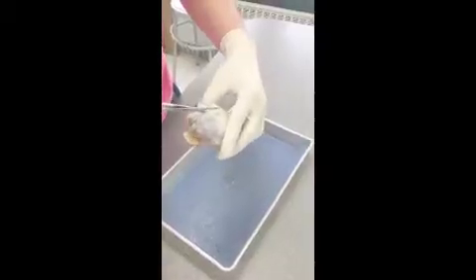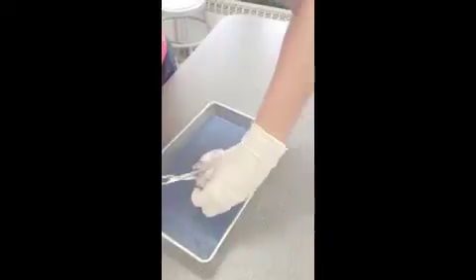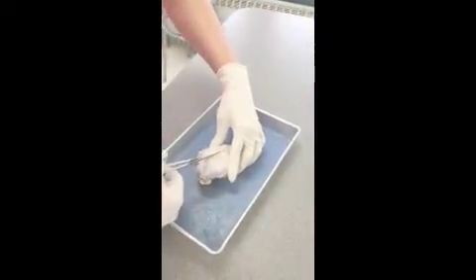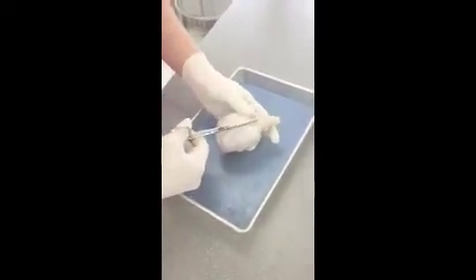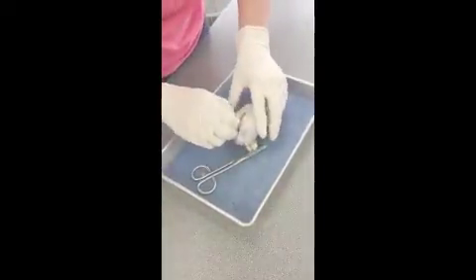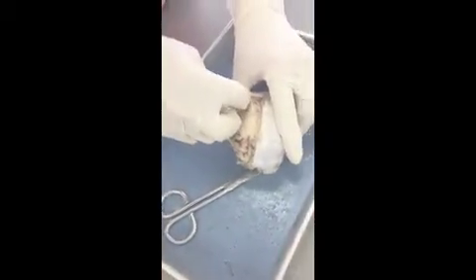The sheep brain is enclosed in a tough outer covering called the dura mater, and this surrounds and supports the dural sinuses and carries blood from the brain to the heart. So we're just going to start off by removing this. This white outer membrane just peels away, and now the brain is exposed.